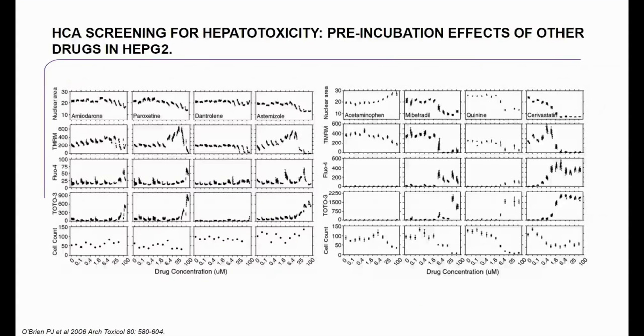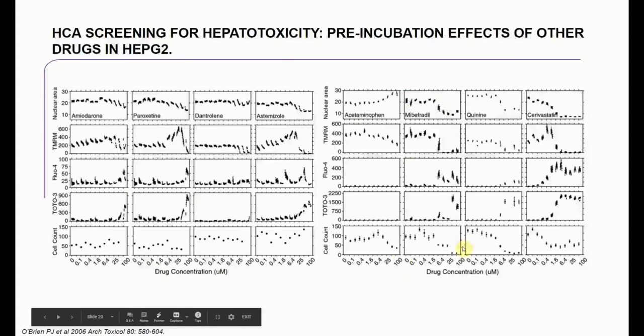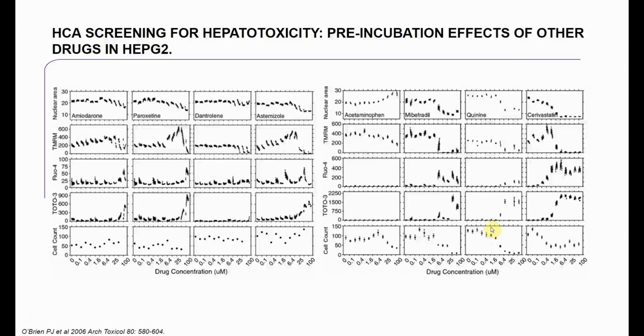So there were a couple of things that setting up this assay highlighted. One was that for certain drugs, pre-incubation with the compound was essential. For certain drugs here on the left, it wasn't required. You could get effects even without pre-incubation of the compound. But with these ones on the right, it really was necessary to get pre-incubation for up to 3 days. So they arrived at a kind of standard set of conditions where you would do pre-incubation for 3 days.